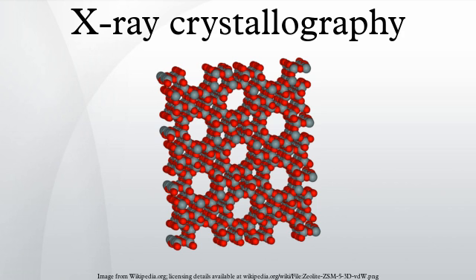Since this thickness corresponds to the diameter of many viruses, a promising direction is the electron diffraction of isolated macromolecular assemblies, such as viral capsids and molecular machines, which may be carried out with a cryo-electron microscope. Moreover, the strong interaction of electrons with matter allows determination of the atomic structure of extremely small volumes. The field of applications for electron crystallography ranges from biomolecules like membrane proteins over organic thin films to the complex structures of intermetallic compounds and zeolites.